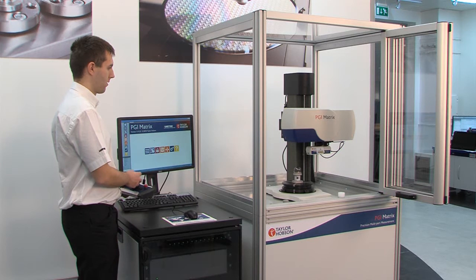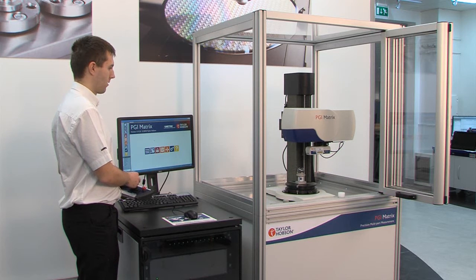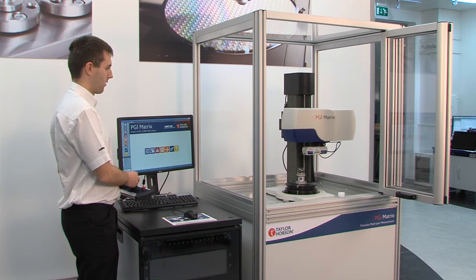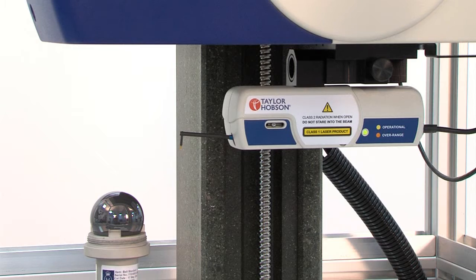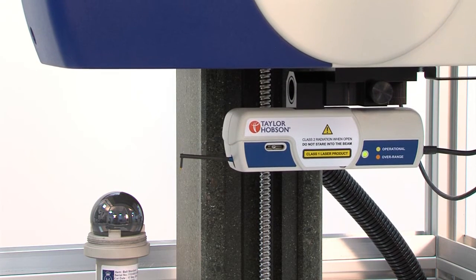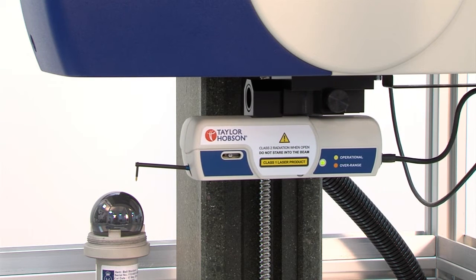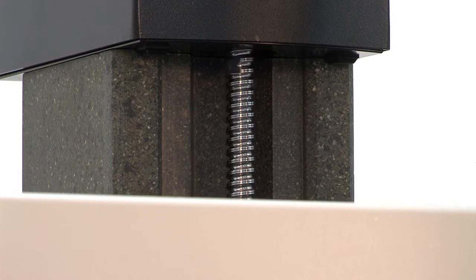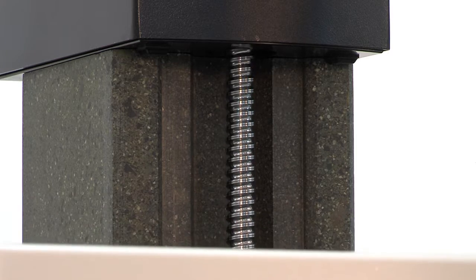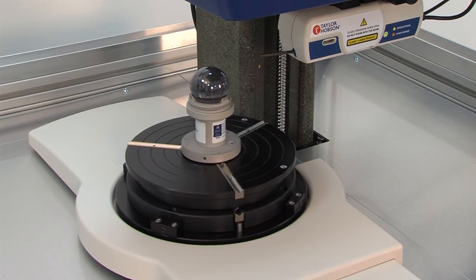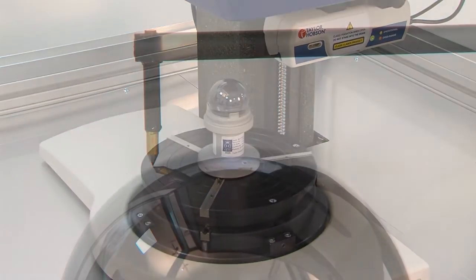The PGI Matrix from Taylor Hobson is a fully automated system for precision optics measurement. It is easy to program, easy to use and extremely accurate. It is packed with powerful analysis tools to improve your capacity and capability.